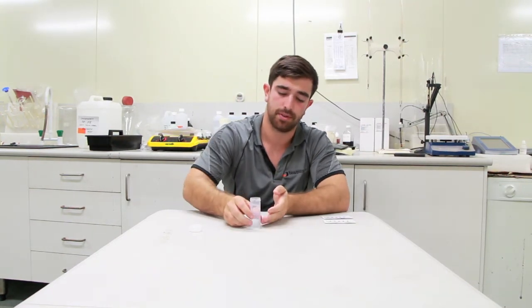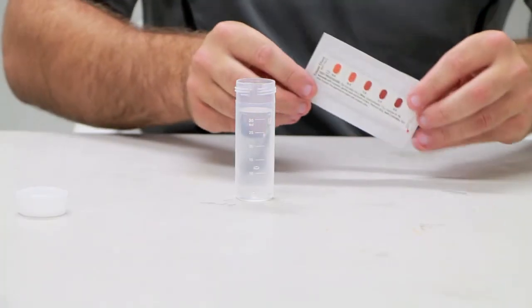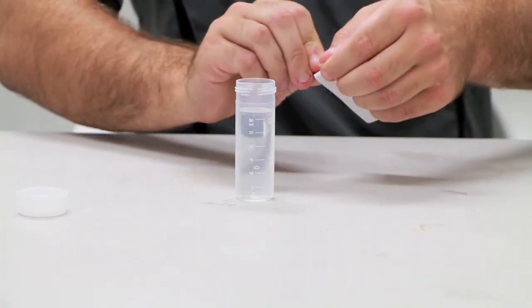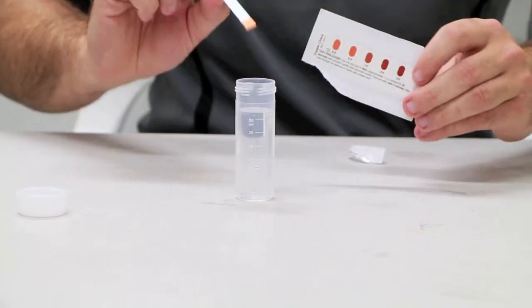To start our test, first fill your sample tube with your sample. Get your copper strips and tear it open, making sure not to tear the colour chart.